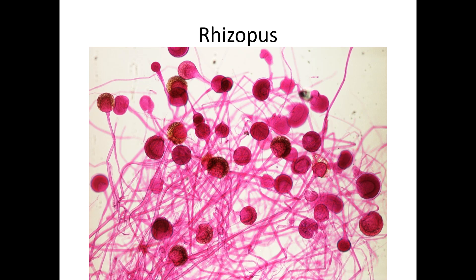Rhizopus — notice it's very thready, which means fungus, so this is another organism in the kingdom Fungi with eukaryotic cells. Instead of skeletal fingers like Penicillium, this one has a ball with a nice little afro coming off the top. This is common black bread mold — so Rhizopus is just another example of a fungus: eukaryotic, not plant or animal.